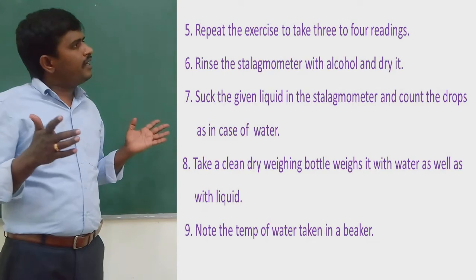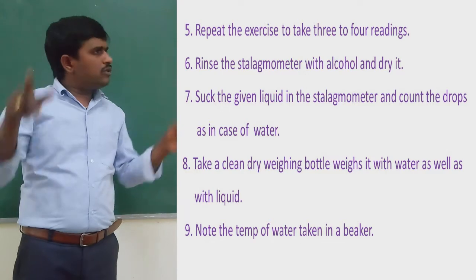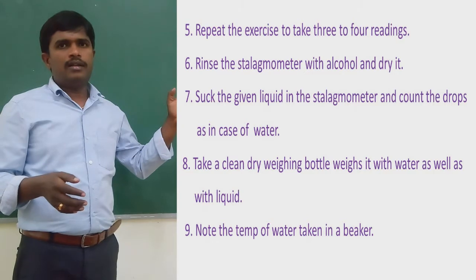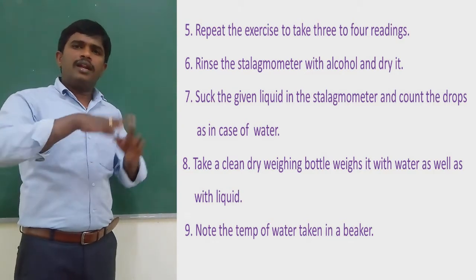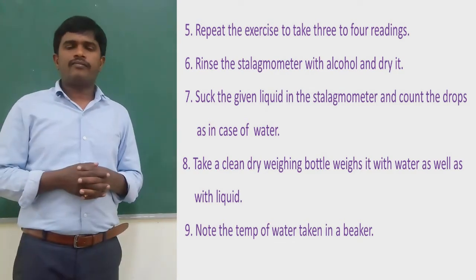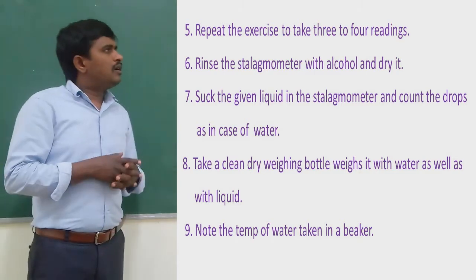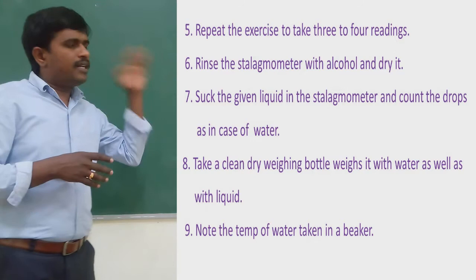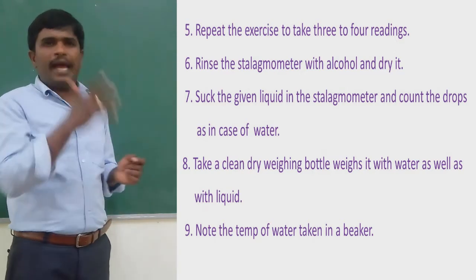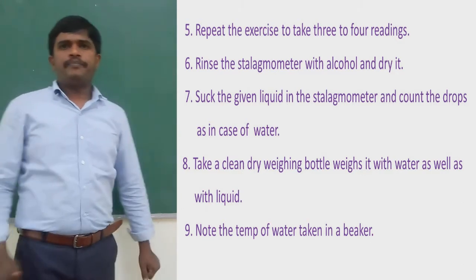And next, we need to count the drops for the liquid also. We have done this for water. Now that water is over, for the liquid, rinse the stalagmometer with alcohol and dry it. Suck the given liquid into the stalagmometer as we have done in the water case and count the drops as in the case of water, the same procedure we have seen for water.